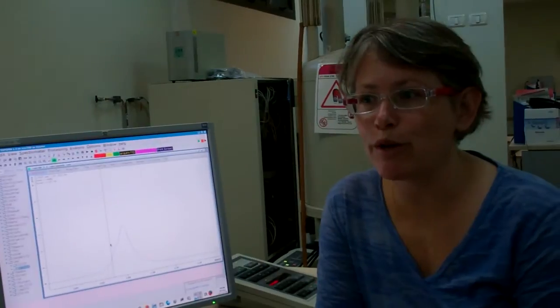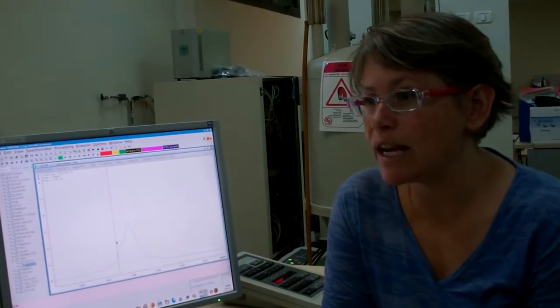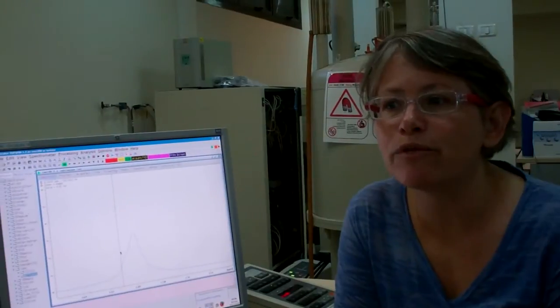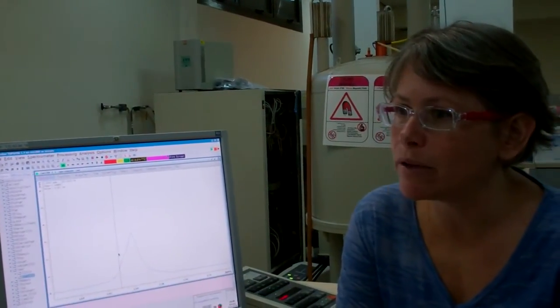Remember from our previous video on shimming, that shimming corrects for external magnetic field inhomogeneities, and this will affect every peak in the spectrum in the same way, as a consistent deviation from the expected Lorentzian line shapes across all the lines in the spectrum.